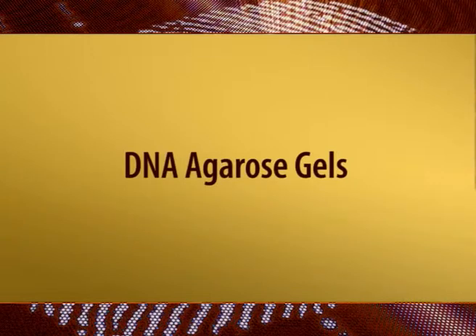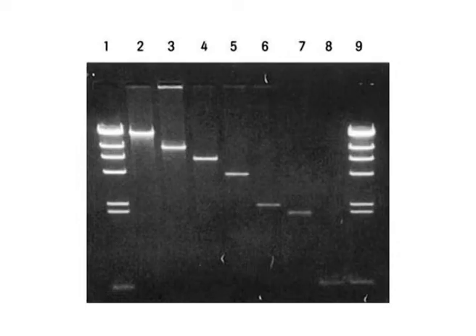DNA agarose gels. The DNA agarose gel technique is a simple process of separation of comparatively large DNA fragments from one another based on their size. The need for detergents is not there for DNA because it already consists of evenly spaced negative phosphate groups. Thus, as with SDS-PAGE, the charge to mass ratio is constant. Also, like SDS-PAGE, the separation results from the matrix itself. The range of size sensitivity can be varied by changing the density of agarose.